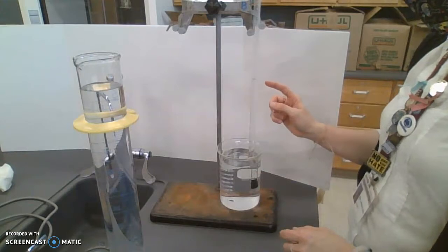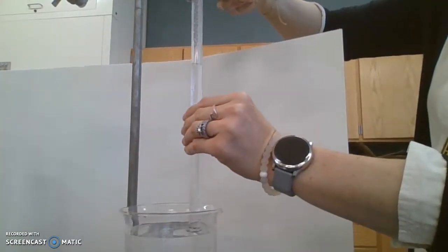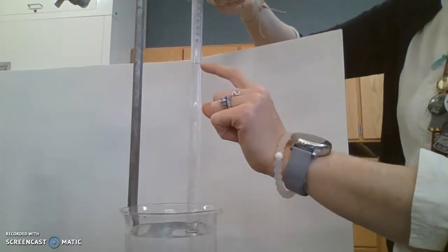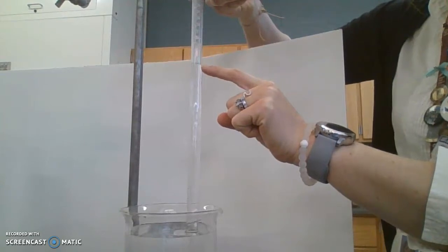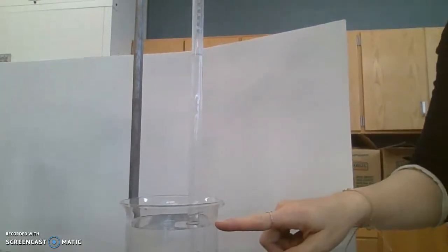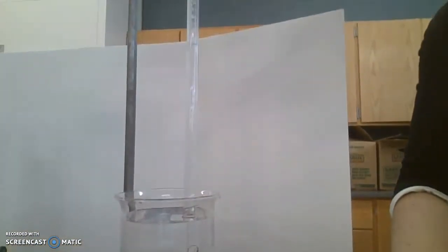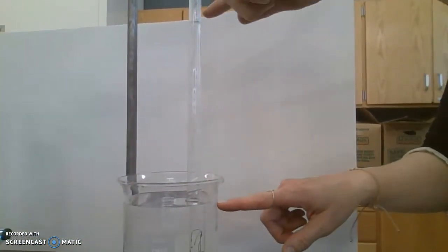And what we see here is our water level inside the eudiometer is about here, but the water level over here in my 600 milliliter beaker is all the way down here. So there's a great difference between these.